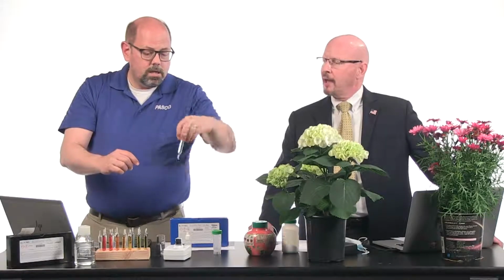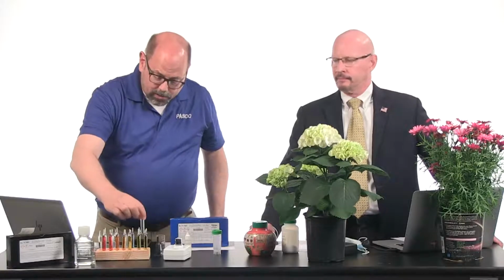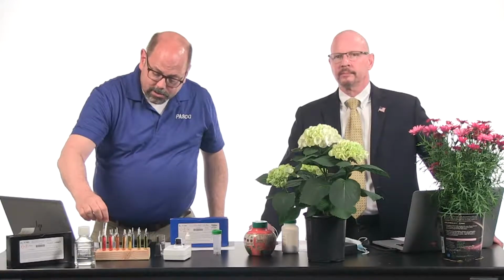Oh, that was quick. It just snapped off the bottom. Yep. And there's a little bubble to help vacuum in there, and exactly. So it sucked it right up in there. And then it does take about a minute to develop. So we'd put it in here, and you'd compare it either to the colors, visibly.